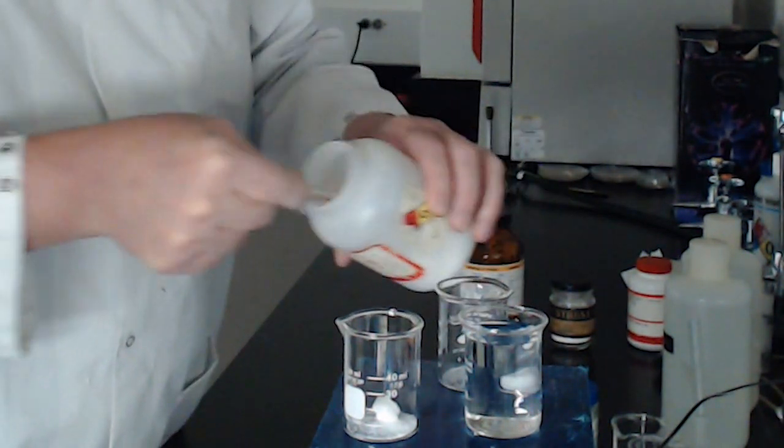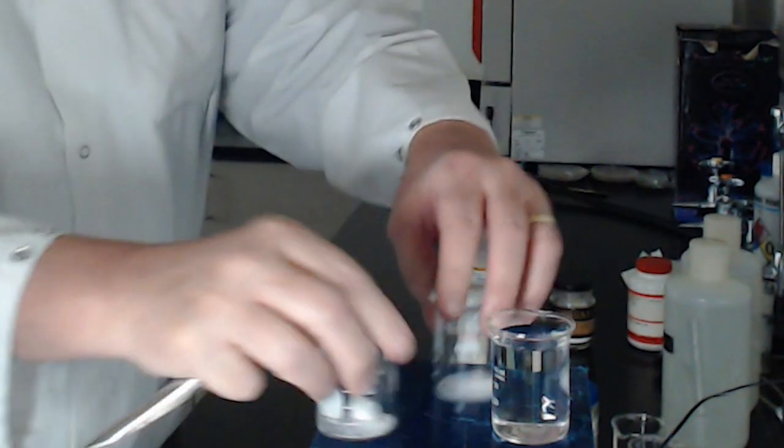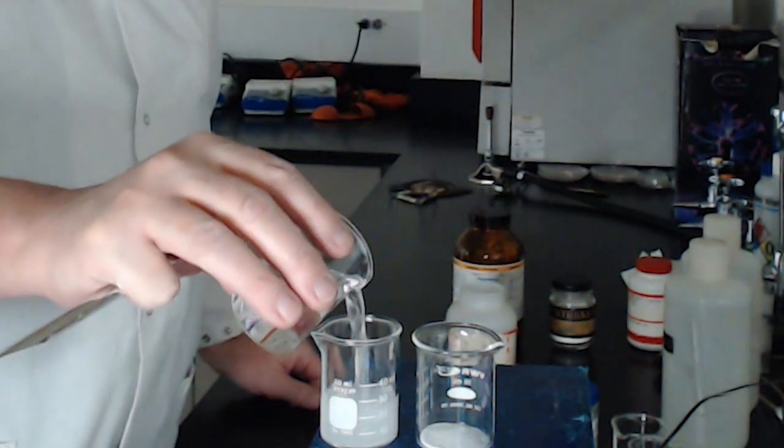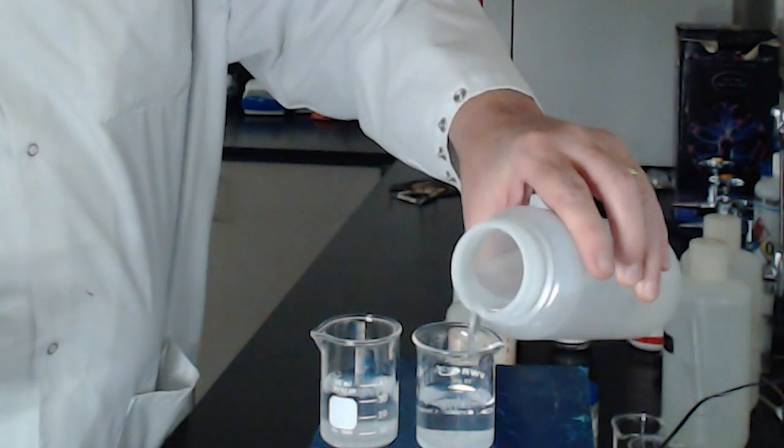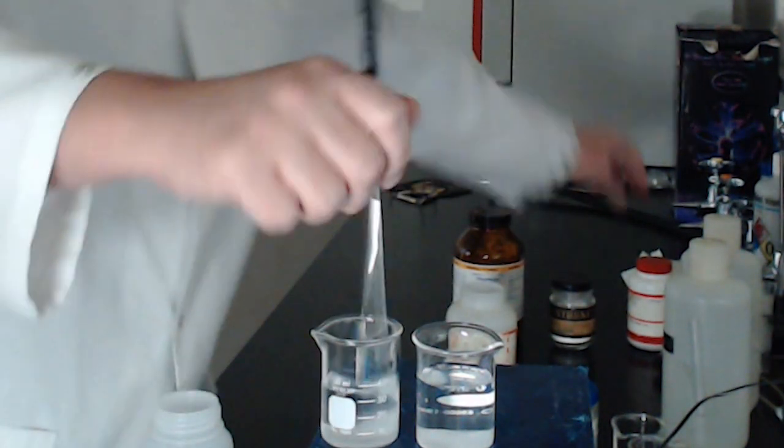Okay, make it approximately the same amount of compounds in each of these. We're now going to add the pure water into both, about the same amount, and do a fast stir.